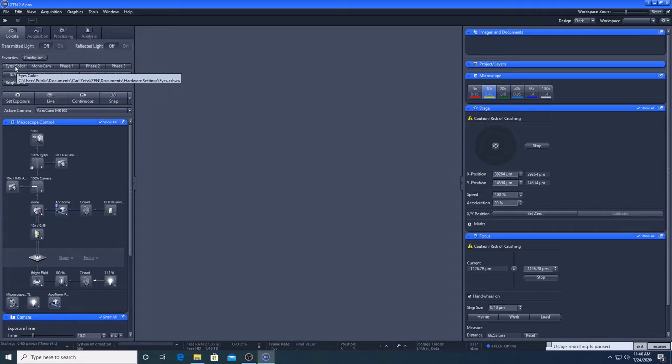Eyes colour is for looking at the sample through the Oculus. Monocam is for viewing the sample with the monochrome camera through the software. You can use these buttons to cycle back and forth between the eyepieces and the camera until you have found your region of interest.